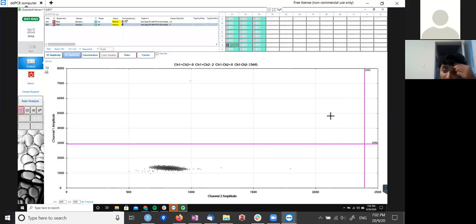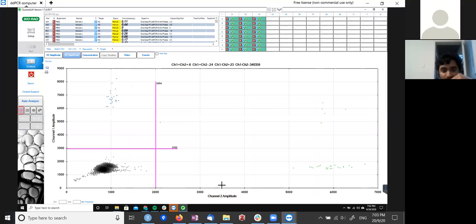Usually when a point is this far from the negative, it's considered positive, because there's no other explanation why the intensity would be so high, unless it's a stray point. But these two here, very close to the negative clusters, are ambiguous. We wouldn't know how to classify them.